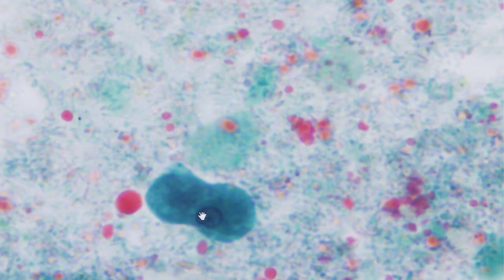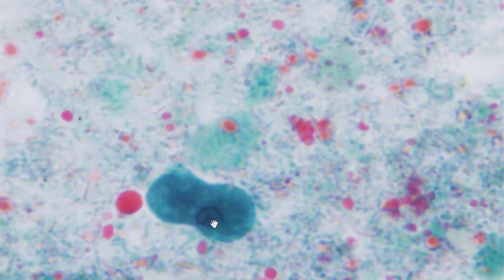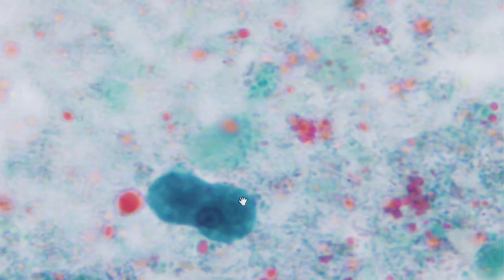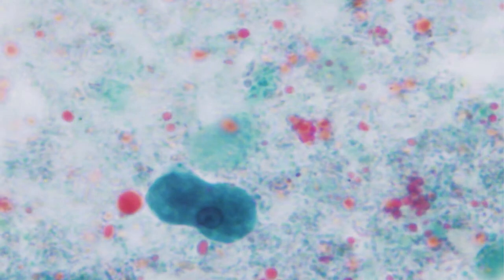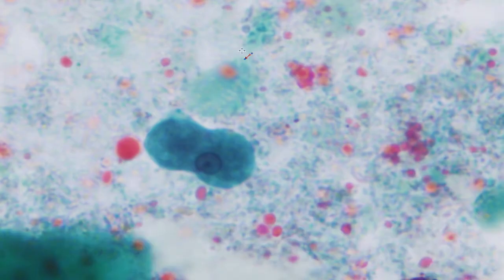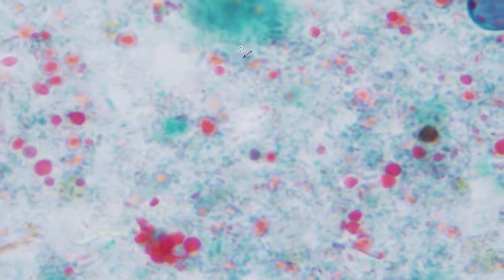You see the evenly distributed peripheral chromatin, central karyosome, and look at that cytoplasm. It's quite even and ground glass in appearance. Let's measure the size, and we get somewhere in the region of 17 micrometers, which is normal for an Entamoeba histolytica. Okay, I'm just going to maximize the view here so that you can see more as I go through. Still moving through this trichrome stained here.